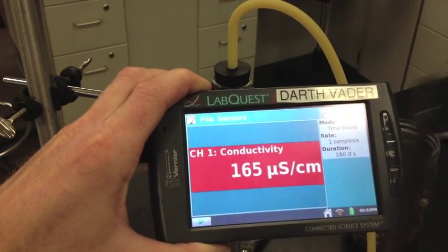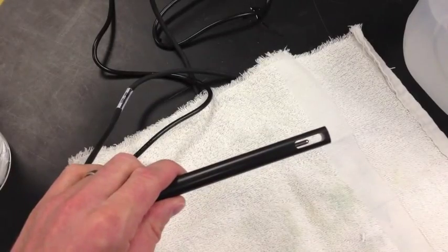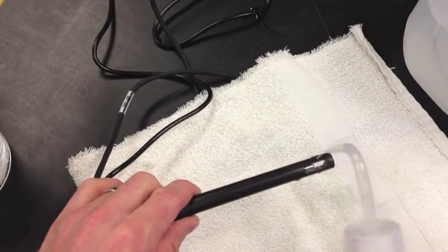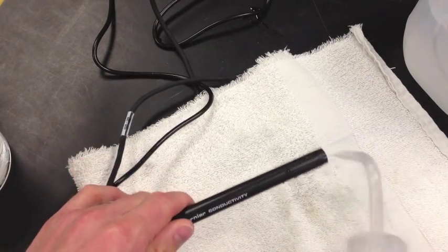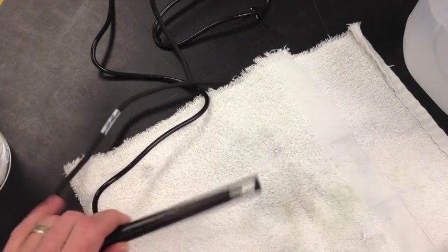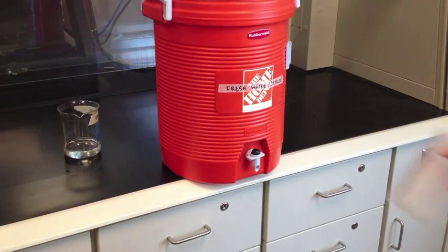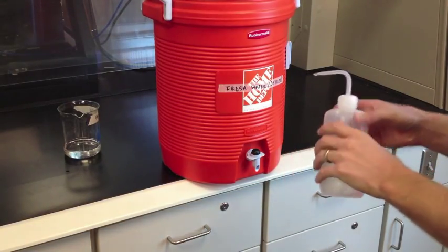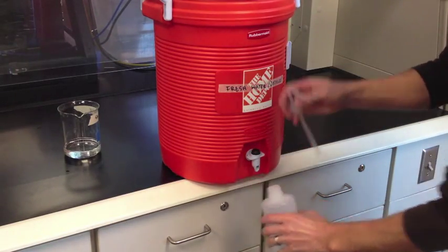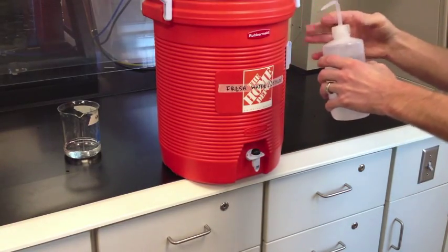Plug your conductivity probe into the LabQuest device. Over a towel, rinse the tip of the conductivity probe with distilled water. Only ever use distilled water for rinsing. If the distilled water ever runs out, make sure to refill it only from the designated distilled water container and not from the sink, so that it always contains purified water.